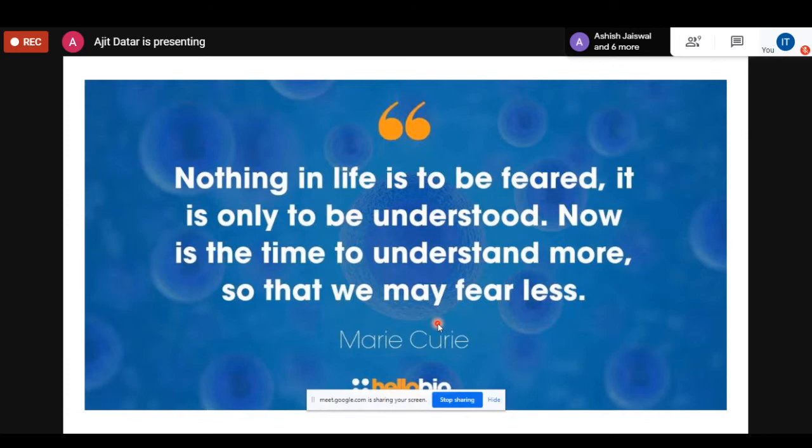What is happening is most of the time, people who do the extraction give the sample to some organization or institute where they have an LCMS-MS or LCMS, and the operator who works on that will just put the sample into whatever column he has and whatever condition he has already set up, and will give some results. Many times those results are absolutely useless. They have wasted time and money because they have to pay for this analysis, and they do not get good results at all.